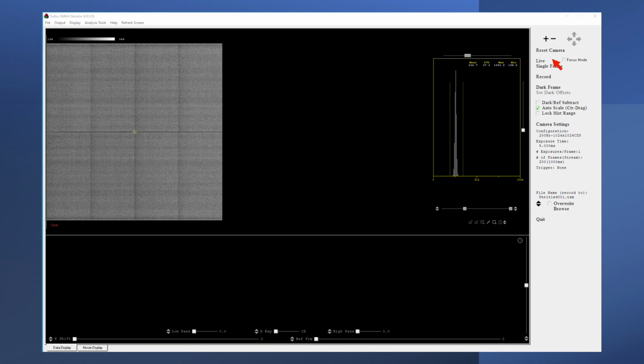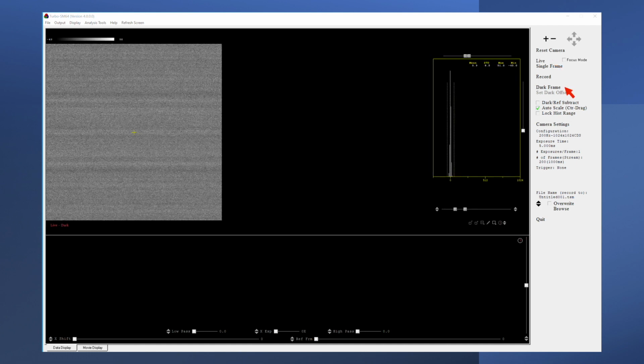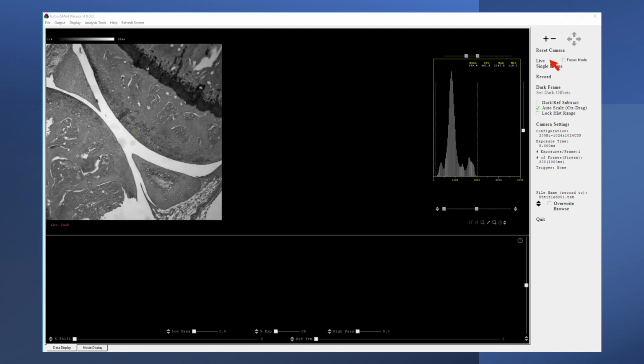As you can see, there is a pattern of 8 channels of DC offsets. This is an image taken in the dark with dark frame subtraction. As you can see, the offset pattern has been removed. You can see a bit of rolling noise, but as soon as there is light, you don't see the noise anymore. Now, data streaming or data recording.